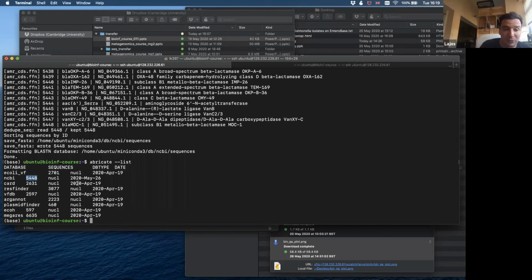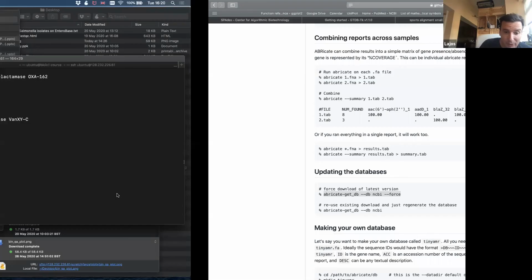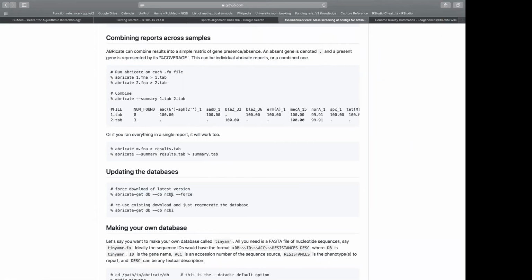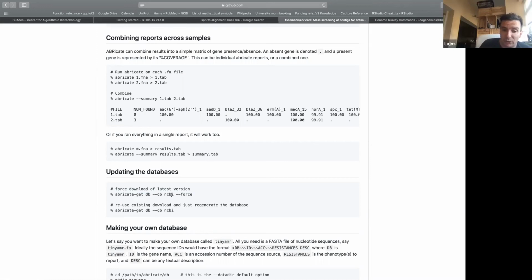I mean, if you want to do it automatically, again, we have 2, 4, 6, 8, 9 different databases. So what you can do again is make a very short script. It can actually be a bash script as well, where you put in all these lines for all the different databases and run it once at the same time, and it will update all the databases with just one command. I can actually show this to you if you want.